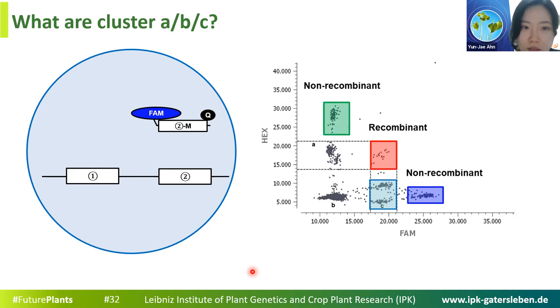Thank you. The next question: why are the numbers of droplets containing two nuclei lower than expected? I think we don't know the reason, but I could assume that the pollen nuclei are acting differently to genomic DNA. Or does Stefan want to add something? No, I basically agree, Jae. I mean, you have tested different nuclear sizes and you always observe the same, so that you have a very low frequency. You have also tested some fluorescent beads and it was similar results. So it looks like a nucleus or a structure might behave differently than nucleic acid typically used.